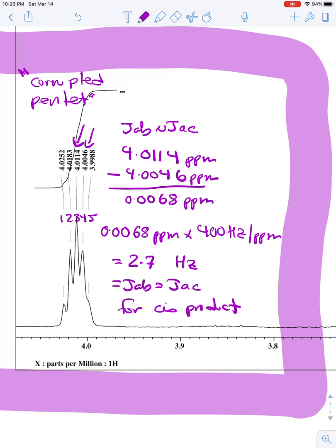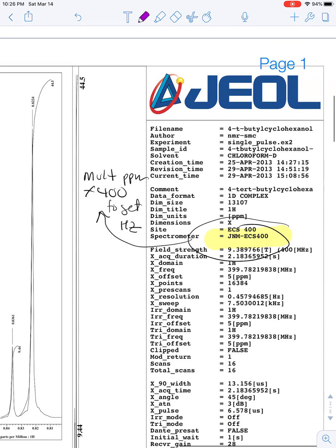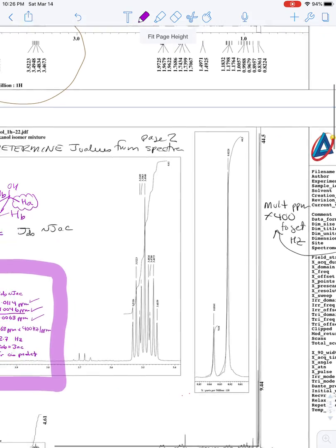And so what we're going to do is we're going to pick those two numbers off the spectrum and subtract the two signal positions in parts per million. That gives us 0.068 parts per million. Then we need to convert it into hertz, and we're going to use the conversion 400 hertz per part per million. And the reason we do that is because the operating frequency of the spectrometer is 400 megahertz.